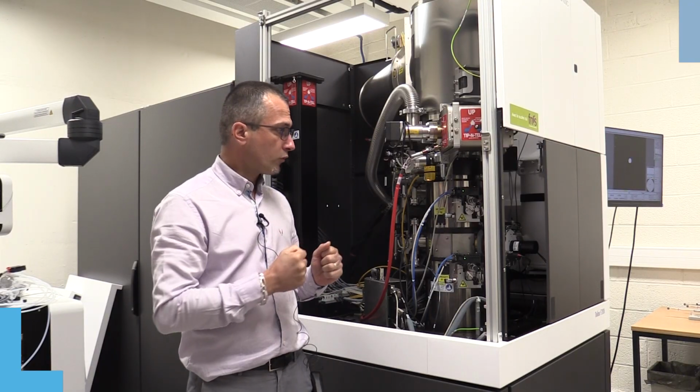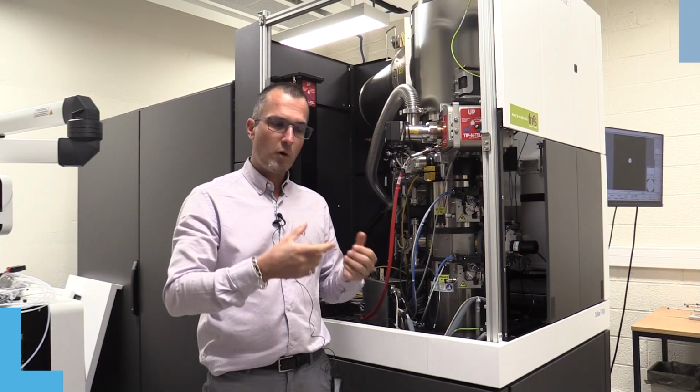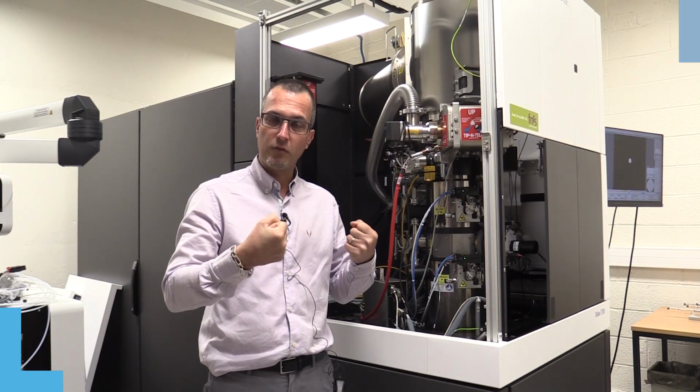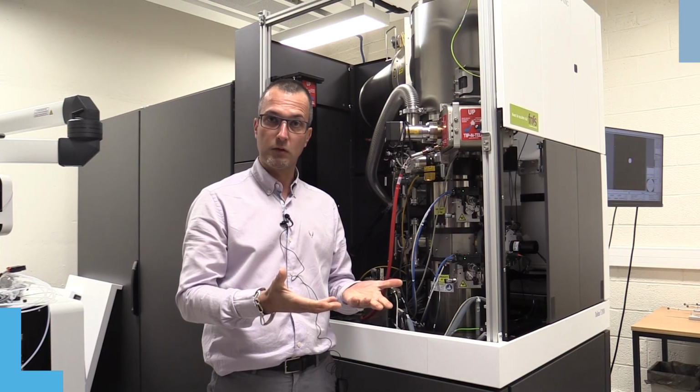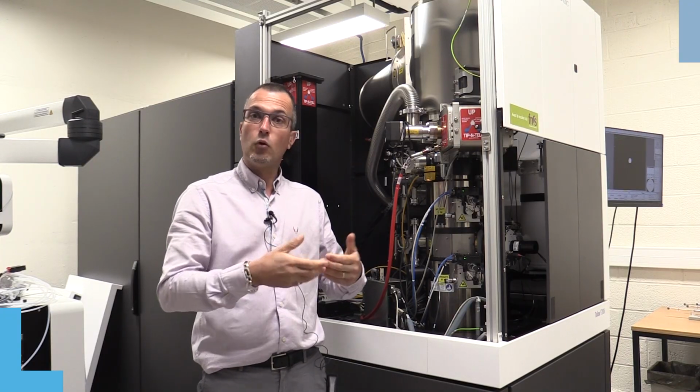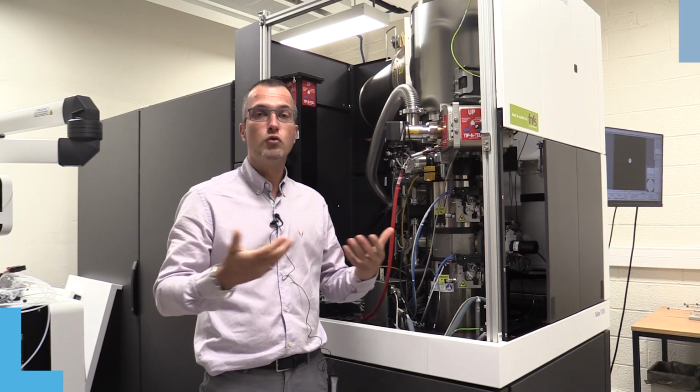We also have another sample holder, which is a mechanical testing holder, where we can pull on the sample and measure how the deformation is applied to the sample, and measure its mechanical behavior, and also see how it moves during deformation.